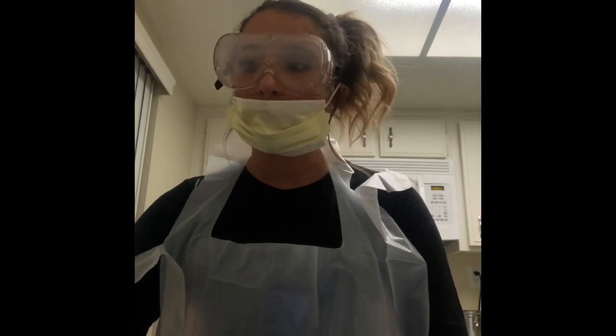Okay, so I have just dissected the sheep's heart. I have located and identified different parts of the heart. I have identified the ones required: the right atrium, right ventricle, left ventricle, interventricular sulcus, and then the 4 that I chose were the aorta, the superior vena cava, pulmonary artery, as well as the right auricle.